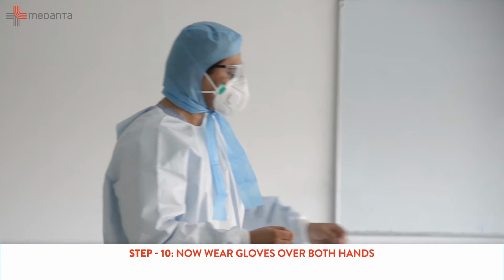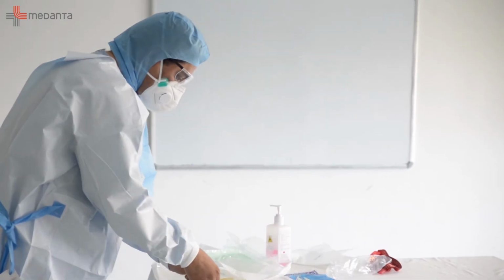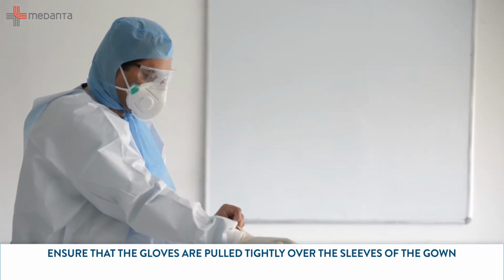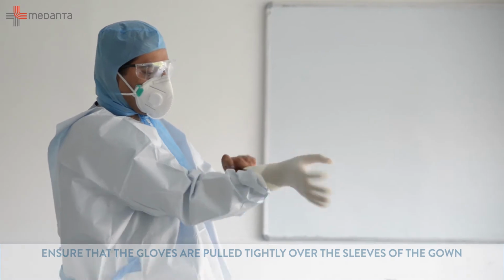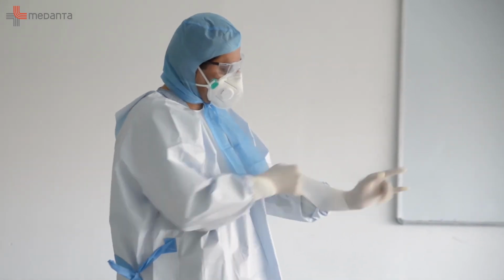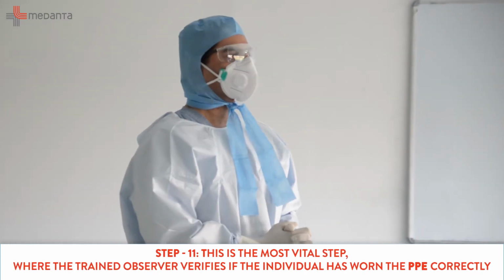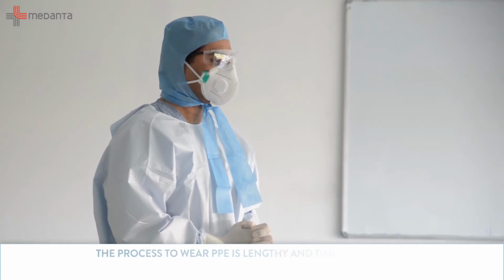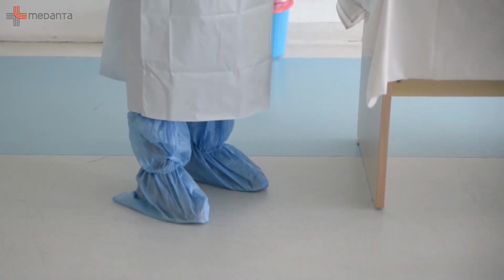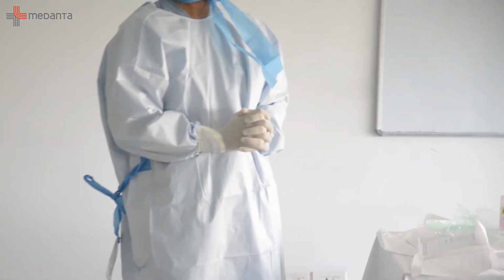Step 10. Now wear gloves over both hands. Ensure that the gloves are pulled tightly over the sleeves of the gown. Next step is that the observer checks if the fittings are correct and worn correctly, because these are the most important steps to proceed with the therapy to the patient. Stay safe, work safe. It is important to practice it with patience and sufficient time, not in a hurry, so that you do it the correct way.